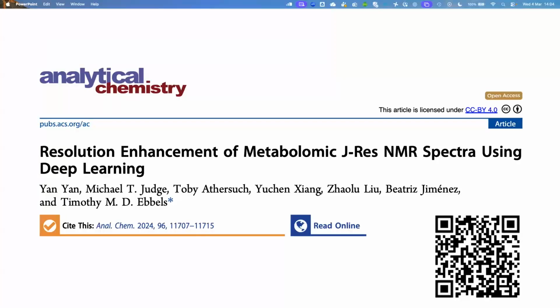And you're absolutely right. You'll get some peaks that in one spectrum will be totally hidden and overlapped, and in other spectra they appear. So you can identify it, track it back into the overlap situation, and get more information. Most of the methods out there for dealing with omics data just look at one sample at a time. This is an example where we're looking at multiple samples and borrowing information between them to solve problems that wouldn't be solvable on one sample alone.